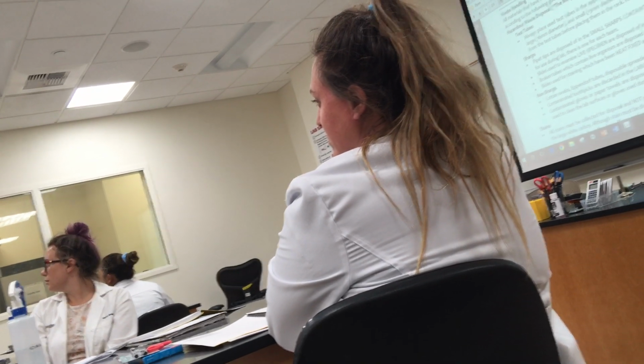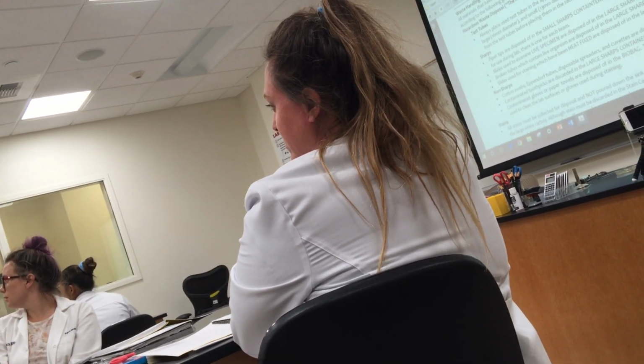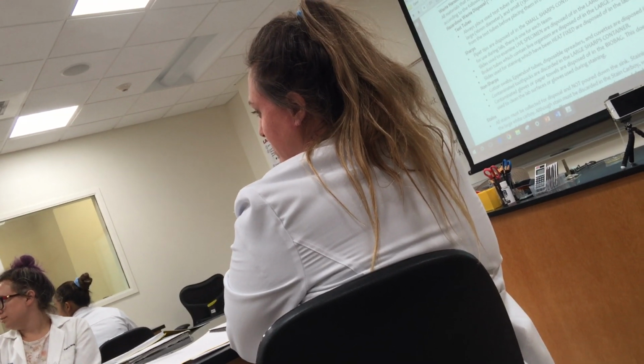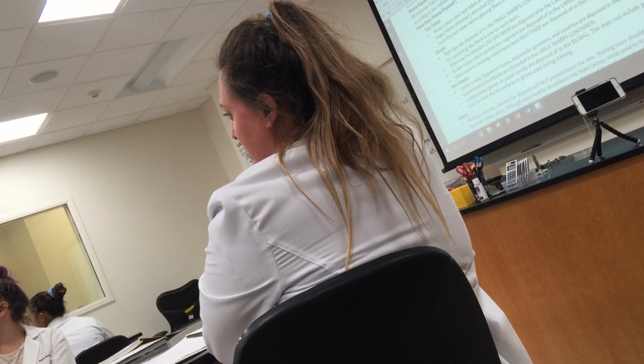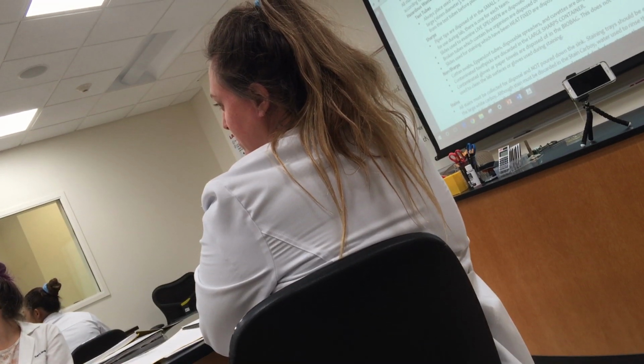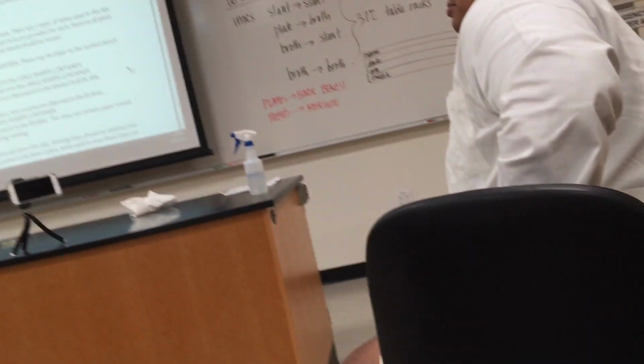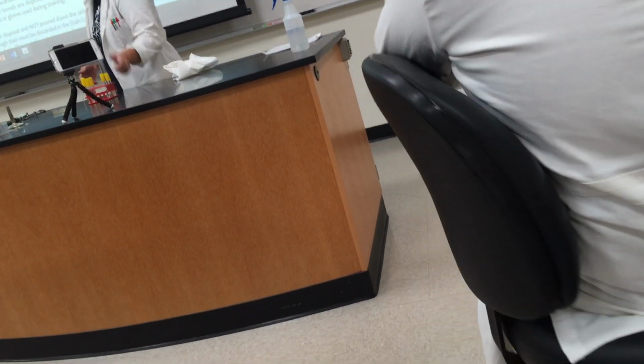What I will do over the next couple days, as we're using areas in the morgue, is show you where to put things. But for today, the only thing going in the morgue are these test tubes of E. coli that you've been taking organism out of and putting over here. So that's the morgue, we call that the morgue, right? The rest of that stuff we'll talk about later because we don't want to overwhelm ourselves with information when we're not even going to be using that information today, right?